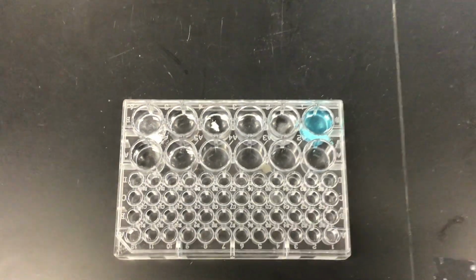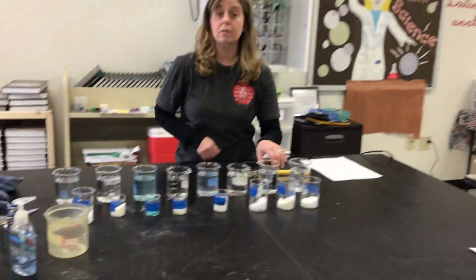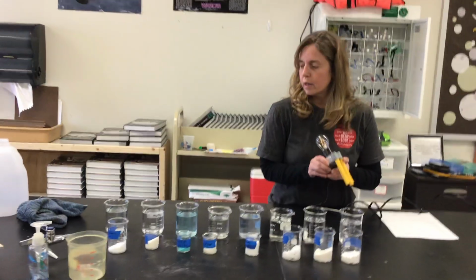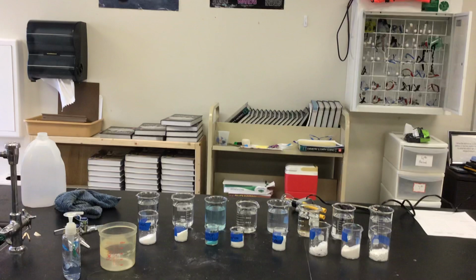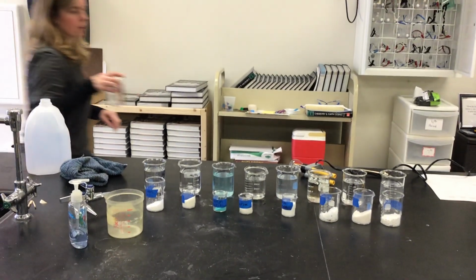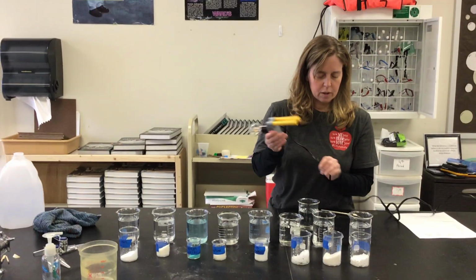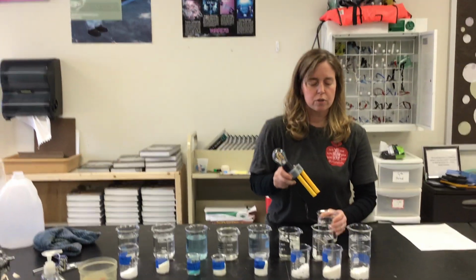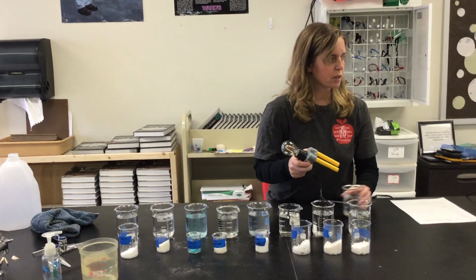Okay? All right, now we're going to go over to the last part, in which this is a big test to see whether or not it conducts electrical current. Okay? So the first one is calcium chloride. And let me get my distilled water. Okay. Here's my distilled water. Each time I'm going to dip it into the distilled water so that we don't get any residue from the one prior as to whether it's going to conduct electrical current.